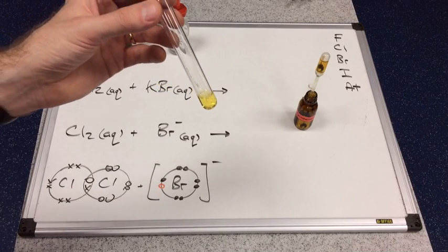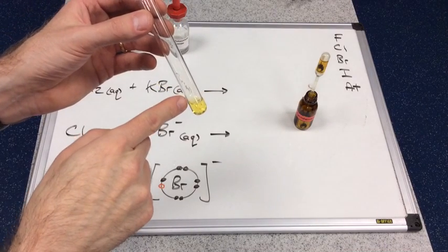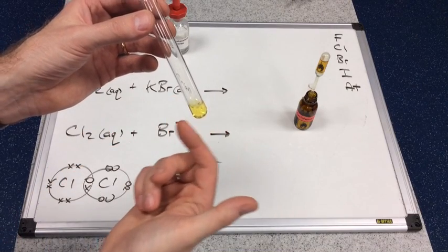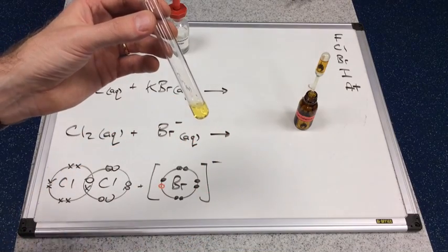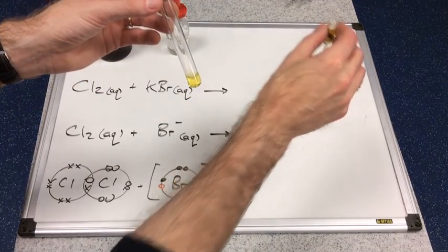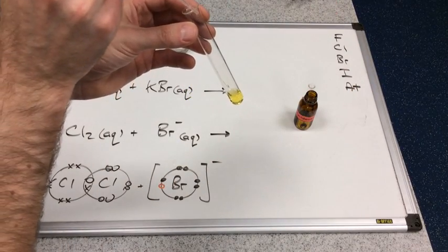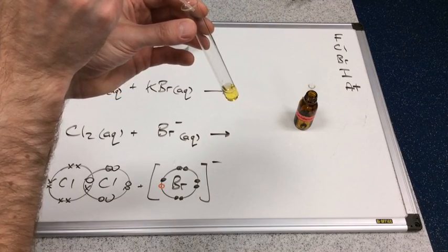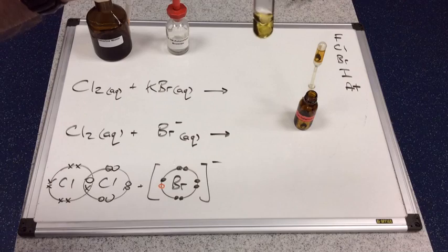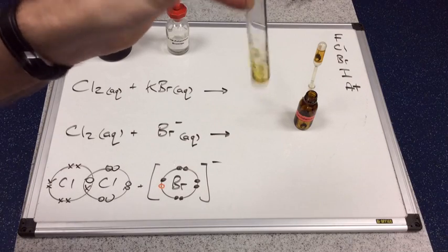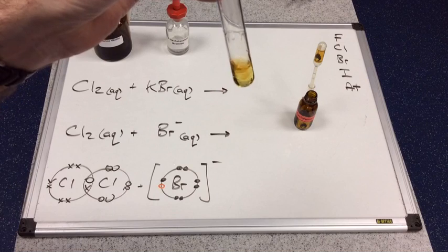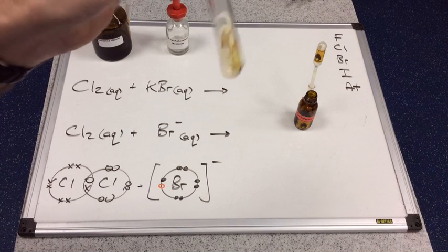I'm going to bring the cyclohexane into play now. I'm going to add a small amount of cyclohexane. At the moment, we've got aqueous conditions in this test tube, and the cyclohexane is actually a non-polar solvent. It's not going to mix with the aqueous layer. It's going to form a separate layer. But hopefully, you'll be able to see the purpose of the cyclohexane once we've given this a good shake.